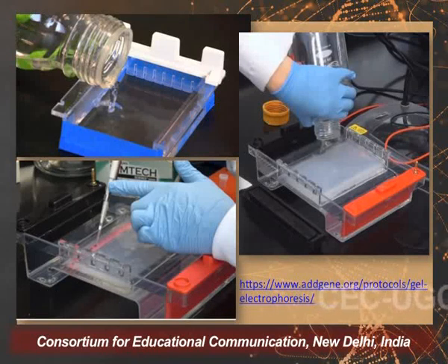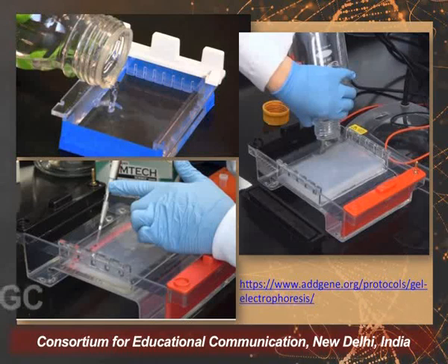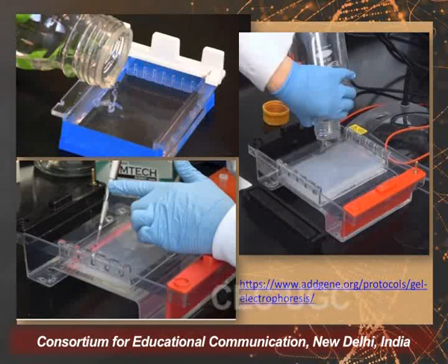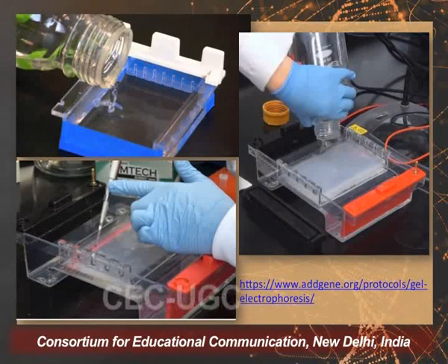and the gel is put inside the tank and the buffer is added. Again, the buffer which is to be used should be the same as the one in which the agarose gel solution was made. Whether you use TBE or TAE does not make a difference, but the solution has to be the same. So it is submerged inside there and then your samples are loaded. Now, you can note here that the samples are blue in color and they are carefully loaded with the pipette, where the pipette tip is lowered down inside the well, and in one go the sample is released into the well.